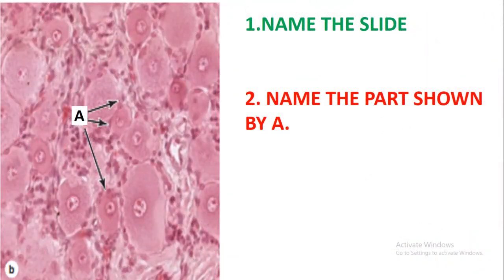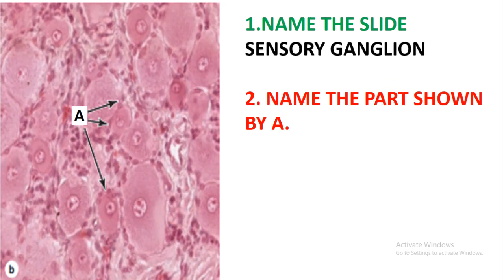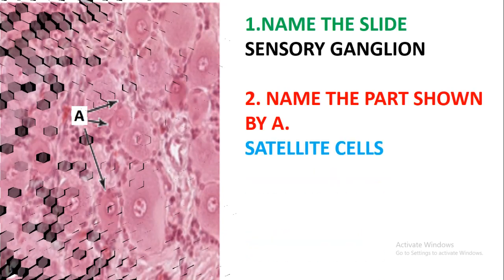The first slide we have been given and asked to name — if you look at this slide, it is having a lot of neural bodies and this slide is just a sensory ganglion. We can name the ganglion cells, which are just the cell bodies in the ganglion.